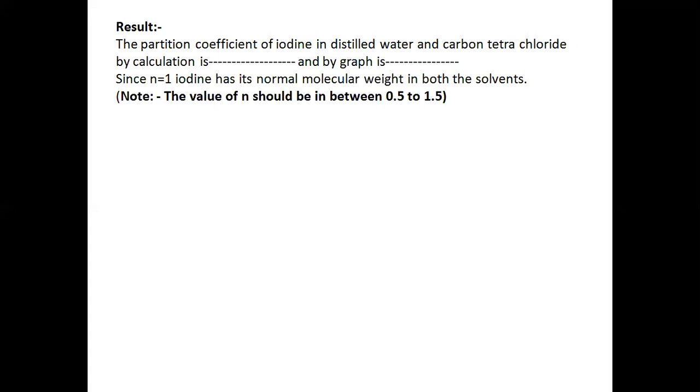Since n is equal to 1, iodine has its normal molecular weight in both the solvents. Note, the value of n should be in between 0.5 to 1.5.